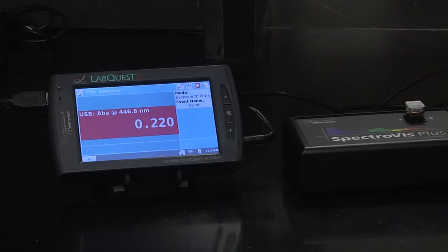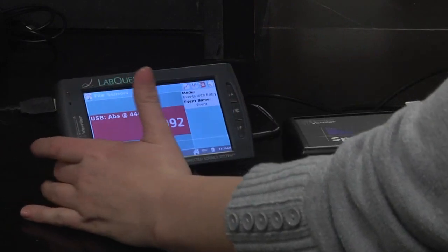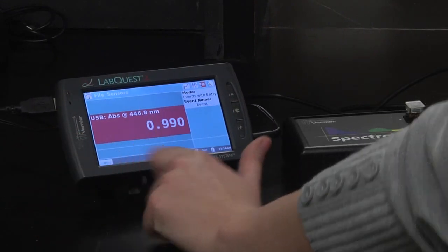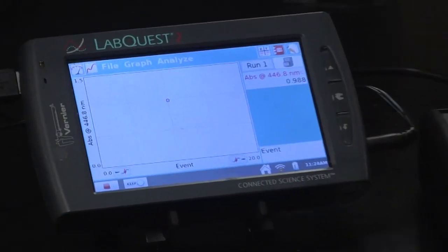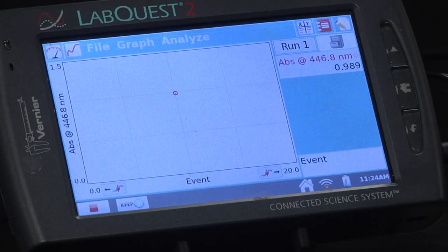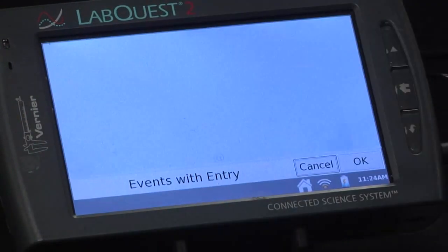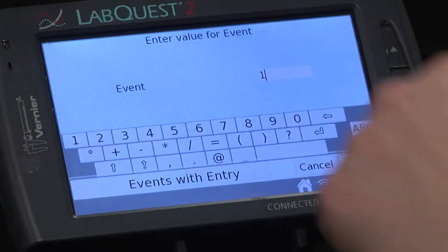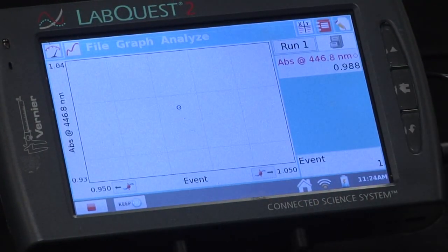Press play down here at the bottom left and it'll change to this graph screen automatically. Once it's settled on a number, you're going to press keep and it'll say beaker number one or event one.